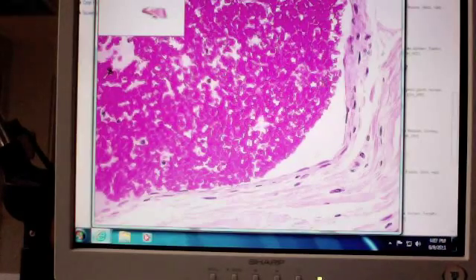All right. Just again, this is not going to appear in an exam, but what structure would you assume that this is given all of these cells here? A blood vessel, okay? And therefore we are looking at what kind of epithelium? Endothelium. Very good.